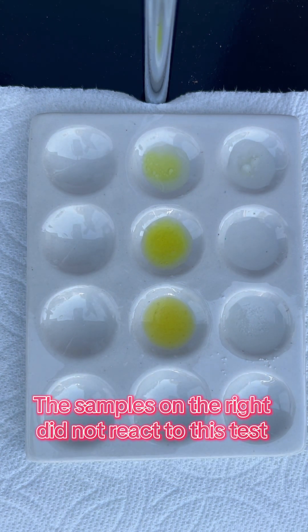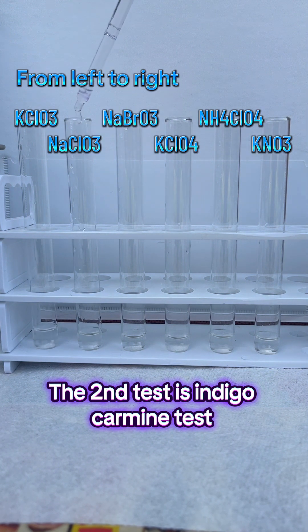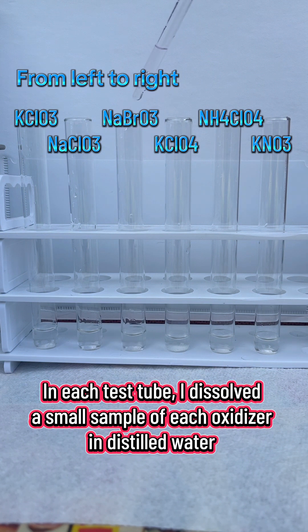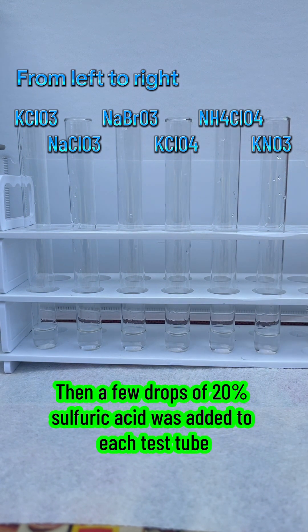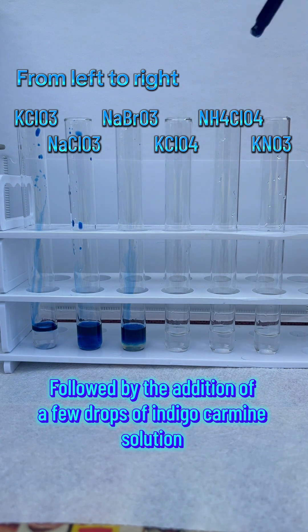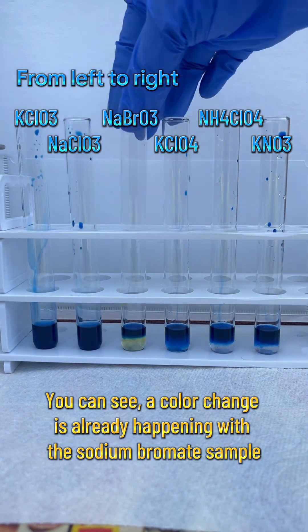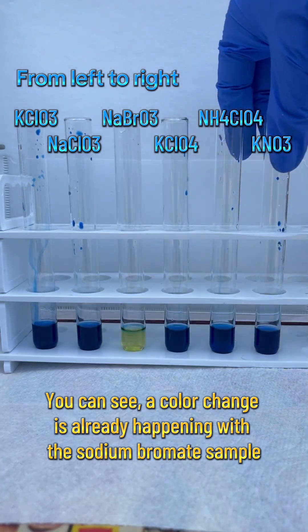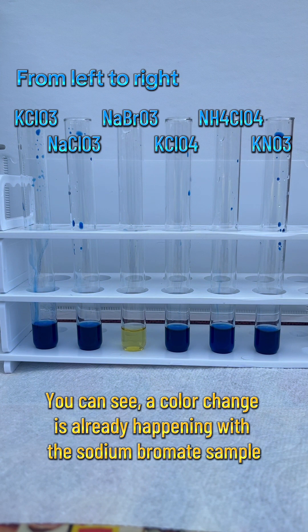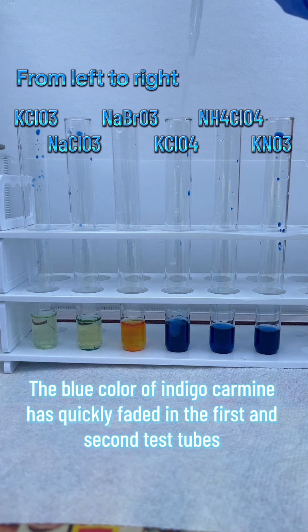The samples on the right did not react to this test. The second test is the indigo-carmine test. In each test tube, I dissolved a small sample of each oxidizer in distilled water. Then a few drops of 20% sulfuric acid was added to each test tube, followed by the addition of a few drops of indigo-carmine solution. You can see a color change is already happening with the sodium bromate sample. Now we will add a small amount of saturated sodium metabisulfite solution into each sample. The blue color of indigo-carmine has quickly faded in the first and second test tubes.